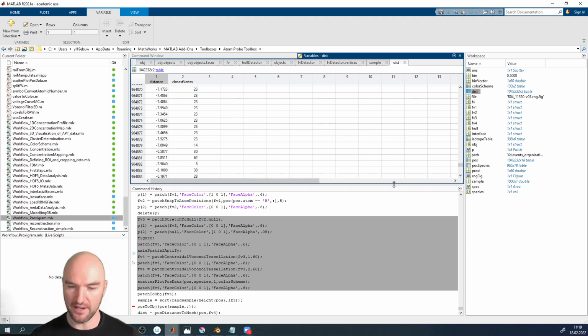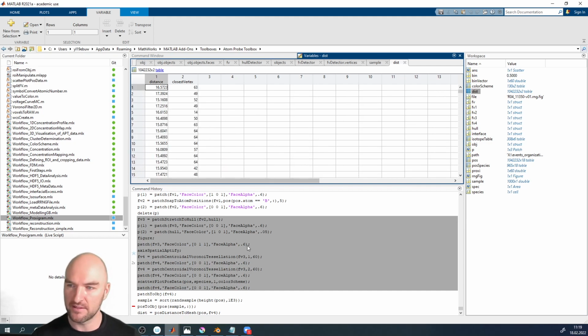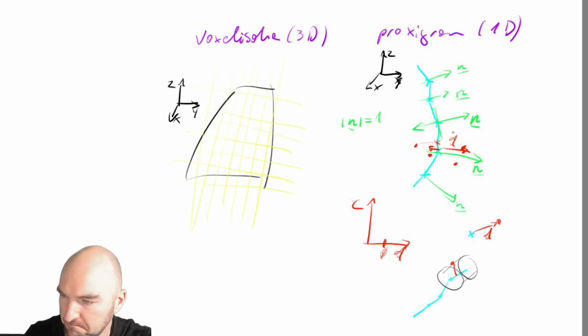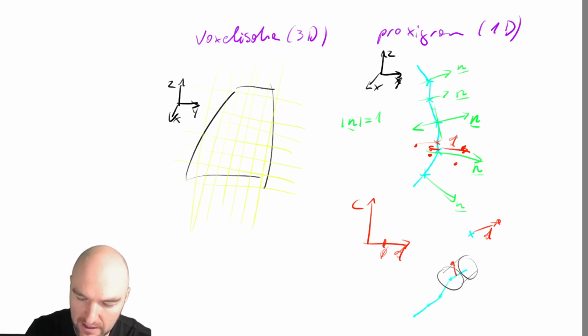So the question is now, how do we know what the surface normal is? And how do we make sure that that's all consistent? Because if I look at just this sketch here, there's nothing that would keep me from drawing the surface normal in the other direction. Because then, if the surface normal points in the other direction, then obviously this value would also swap. We would look in the different direction, because the surface normal has a direction. So how do we find the direction of the surface normal?